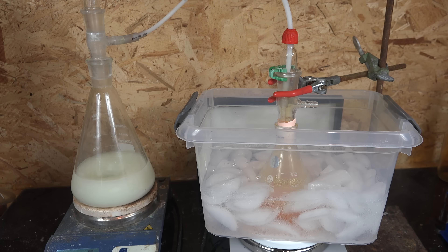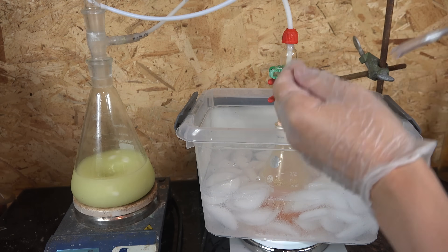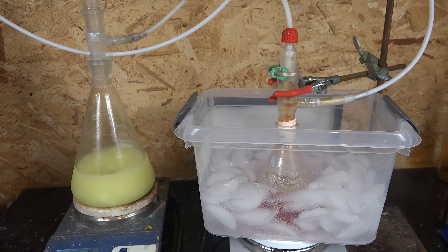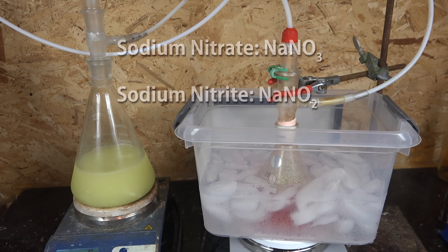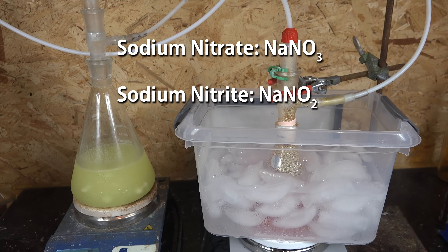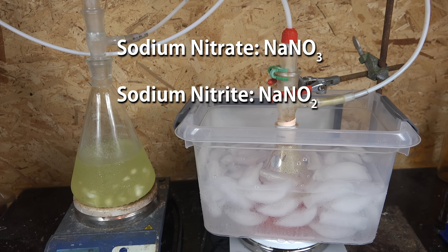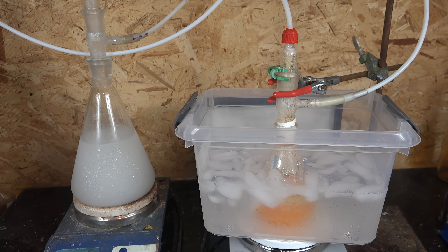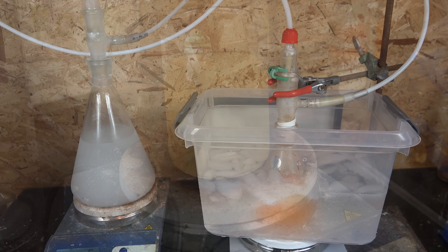Greetings fellow nerds. This is another lab notes video where I research procedures I don't have experience with. What this means is that I will stumble around and mix stuff haphazardly, and whatever I find, I'll pretend that's exactly what I was trying to do. So my objective was to make sodium nitrite. It's different from the more commonly available sodium nitrate in that it has one less oxygen atom. I want sodium nitrite to produce various metal complexes. Unfortunately, nitrite isn't very stable under a lot of conditions, so it's notoriously difficult to synthesize for the amateur — and unfortunately that includes me.